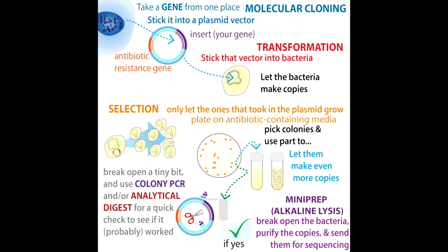Any that take in the plasmid, and most of the bacteria actually probably die, because the chemically competent cells are basically weakened to the point that they're almost dead, and then we transform them. So yeah, we usually have to do a recovery step after we transform them.